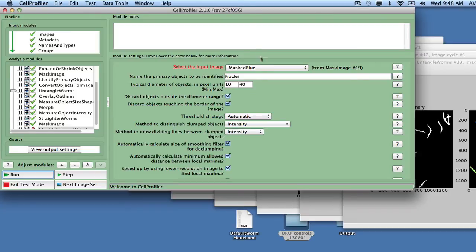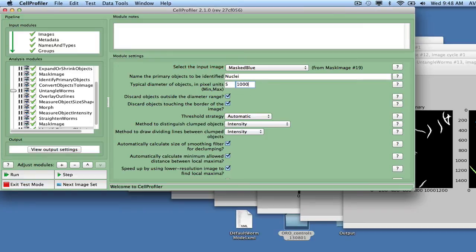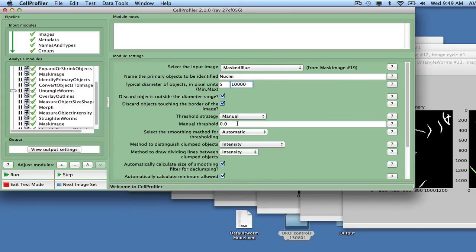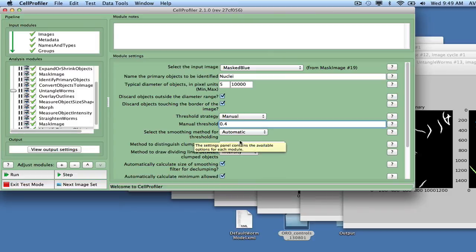This fixed threshold was selected by trying a range of thresholds and viewing the result, and should be adjusted for a new dataset. We do not attempt to separate clumped objects, but we do retain the outlines. We will call the output objects fat objects and the outlines fat outlines.